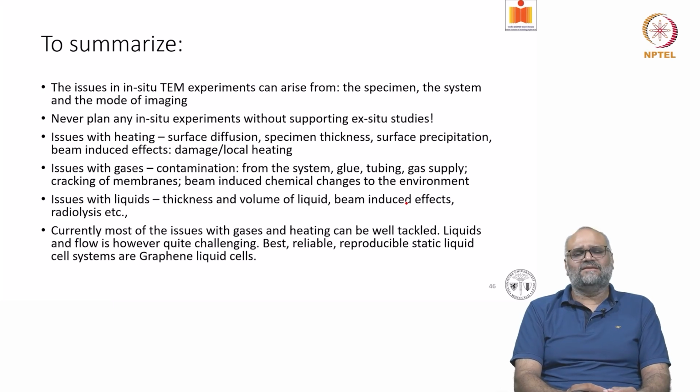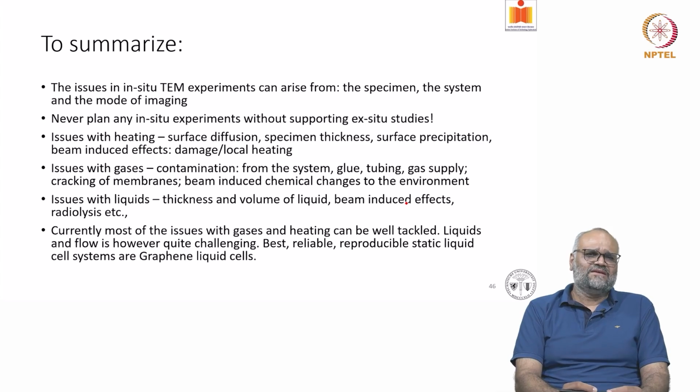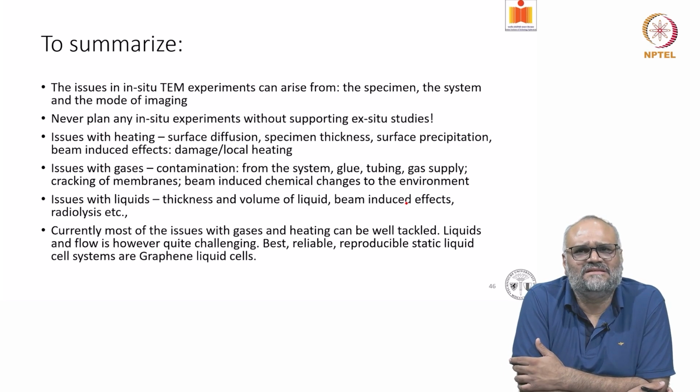And with that, I think we are reaching the end of this course. I've talked about imaging modes, and I've also shown various examples. We understood the mechanisms of how different modes of imaging in transmission electron microscopes work. We've also seen examples of applications and different kinds of case studies, and we also saw an extension of the technique to newer developments such as in situ microscopy. And in the next lecture, I'll be summarizing what we've covered in this entire course. And with this, I'd like to end here.